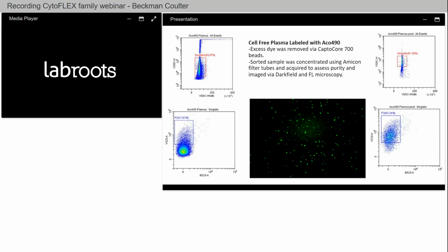Granted, am I saying these are all just extracellular vesicles? No. There's a good chance they are, simply because we are using the fluorogenic dye that needs to transect the bilayer of an extracellular vesicle, so it should not label lipoproteins that may exist or other things. These samples are cleared, hopefully, for that task. And on top of that, we do get a nice picture. We're not seeing a lot of other large contaminants or clustering. So we had some confidence, and this is just one representative, but it's not an N of one. So we have been able to do this a few times.